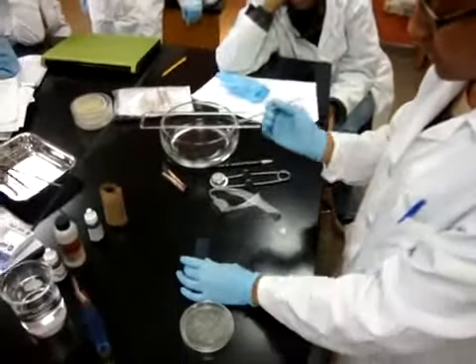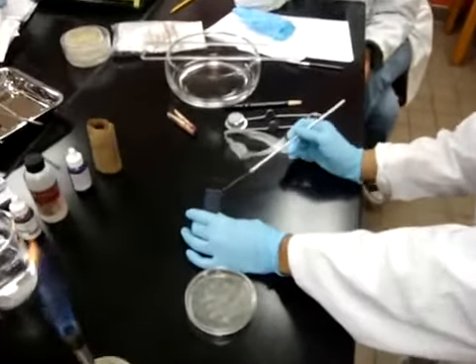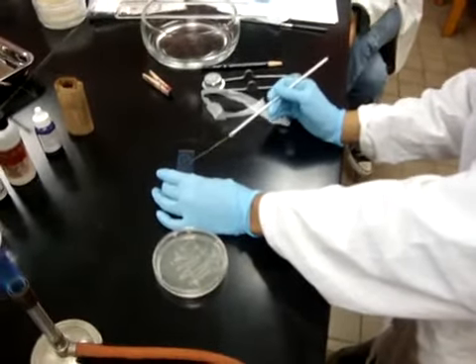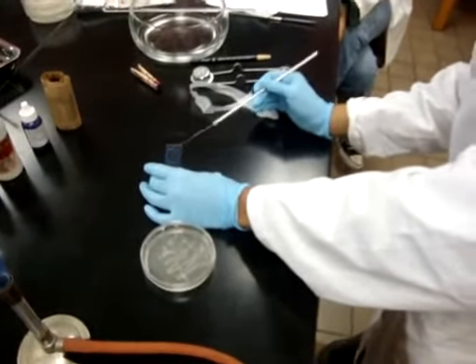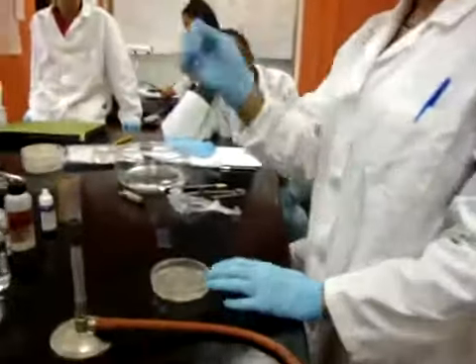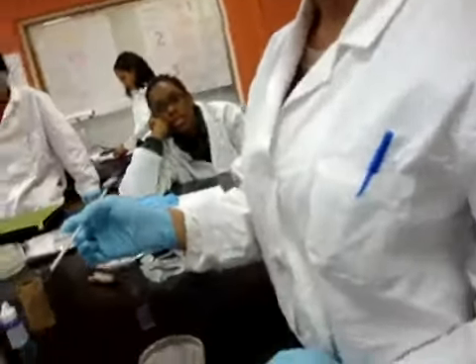So I have a tiny bit of bacteria on the tip of my loop, and I'm going to smear it in that drop of water that I put. And make sure you smear it all around your target circle. Cool. Then what do I do? Sterilize my loop because it has living bacteria on the tip of it.